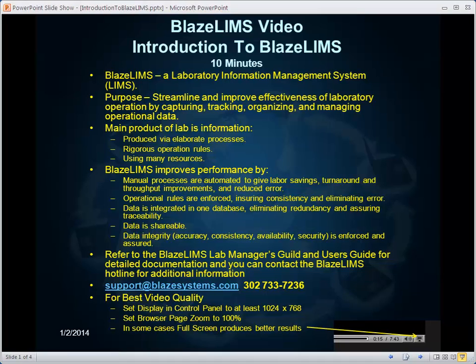Welcome to this video where you will be introduced to the fundamentals of BlazeLIMS. It will take about 10 minutes of your time. BlazeLIMS is a Laboratory Information Management System, or LIMS for short. Its purpose is to streamline and improve the effectiveness of laboratory operation by capturing, tracking, organizing, and managing operational data.